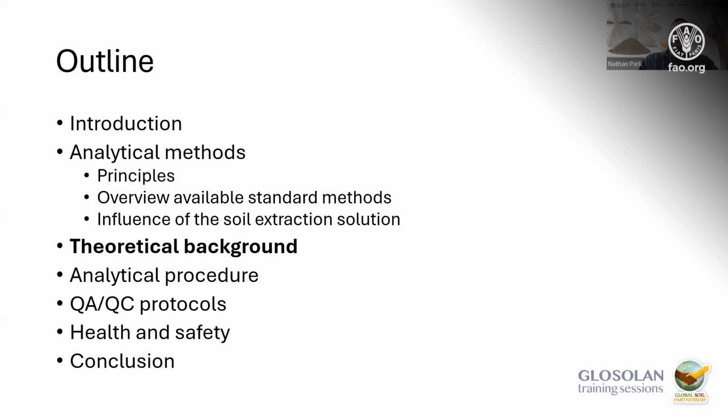It looked like the European methodology uses a soil volume, not mass. That seems inaccurate and difficult to measure. Do you just use a graduated cylinder, or what do you do about different soil textures? I will show it later. We use a spoon where we know exactly that it contains 10 milliliter of sample, and we have defined it before, and we use that spoon to define it. But I will show it later in the presentation.